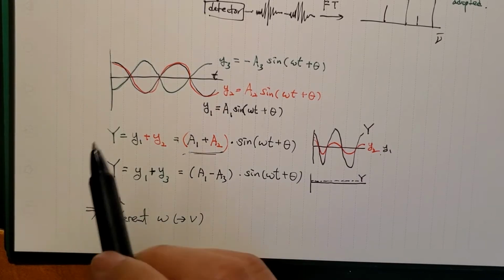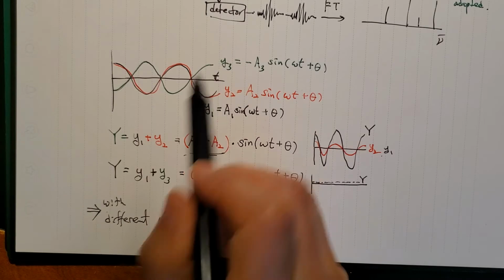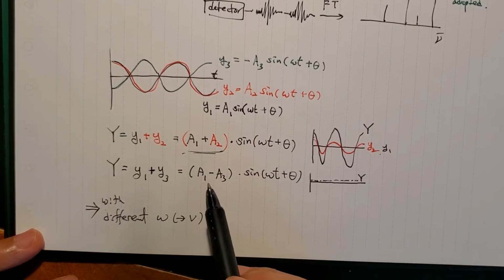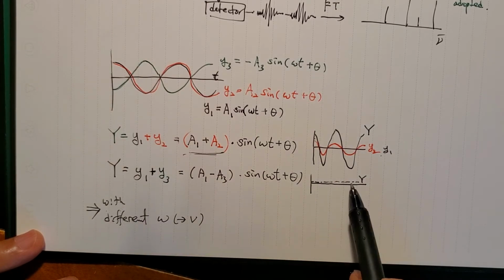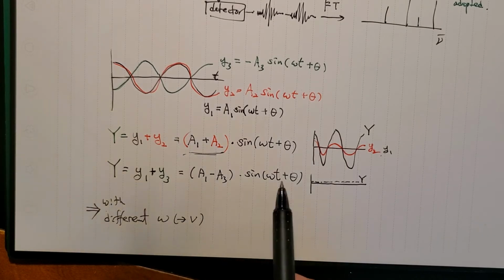Well, if you have to interfere with light 3 that has a completely opposite phase, the opposite phase will have destructive interference. So if you add them up, you have, say, exactly the same intensity, the amplitude, then you'll cancel and it becomes 0, right? But if they're not exactly the same, it ends up making the wave weaker.